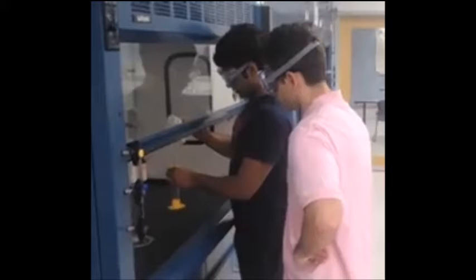Your general laboratory should have a designated area for broken glass, and that's the only place it should be discarded in. There should also be a biohazard safety bin for certain proteins or bacteria, and you can probably find them labeled in your lab somewhere. This is the only place where biohazardous material should be disposed of. And last but not least, there should be a sharps disposal box within your laboratory. Any sharp items or Pasteur pipettes should be discarded in there.